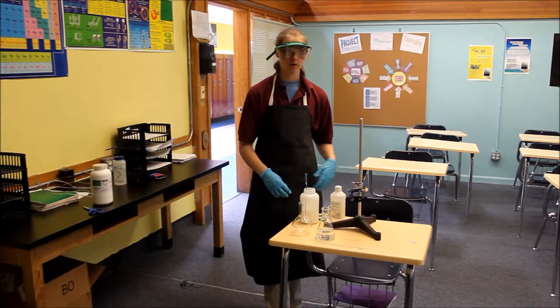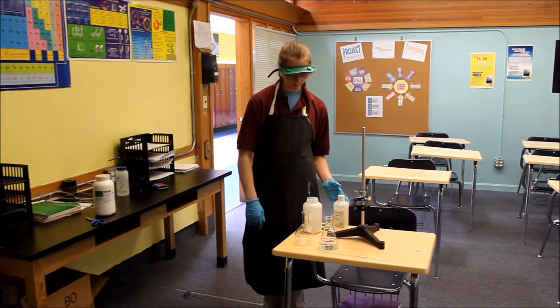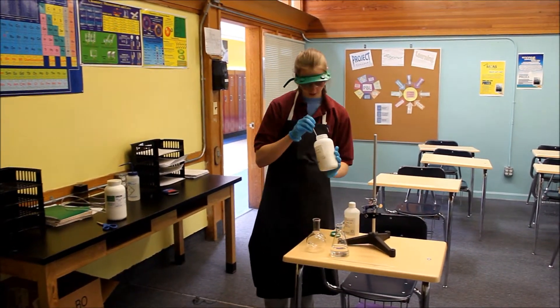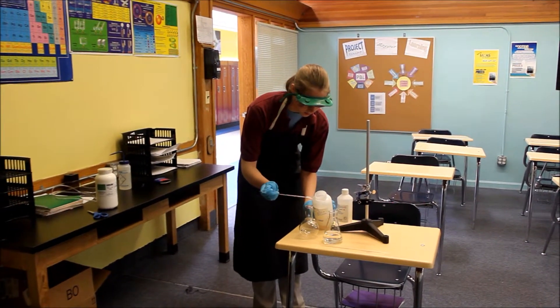Hi, my name is Sarah Tuttle and I go to Hampton Charter School of Science. My project is an ammonia fountain. First, we need to put some ammonium chloride and calcium hydroxide into this beaker.